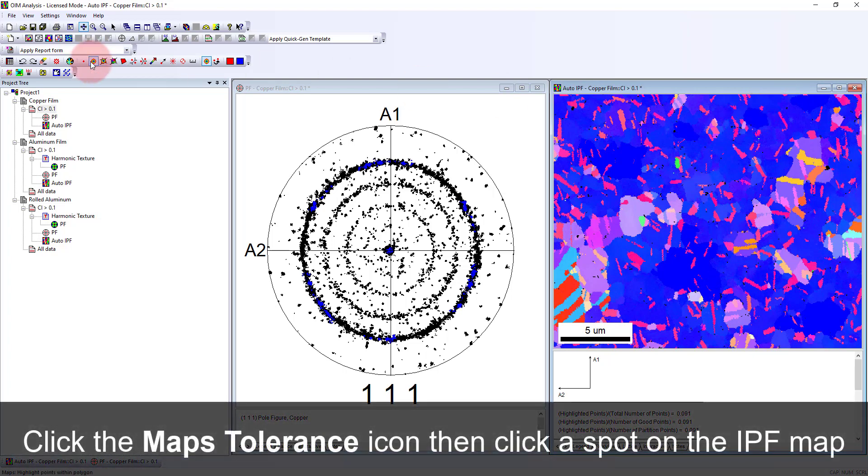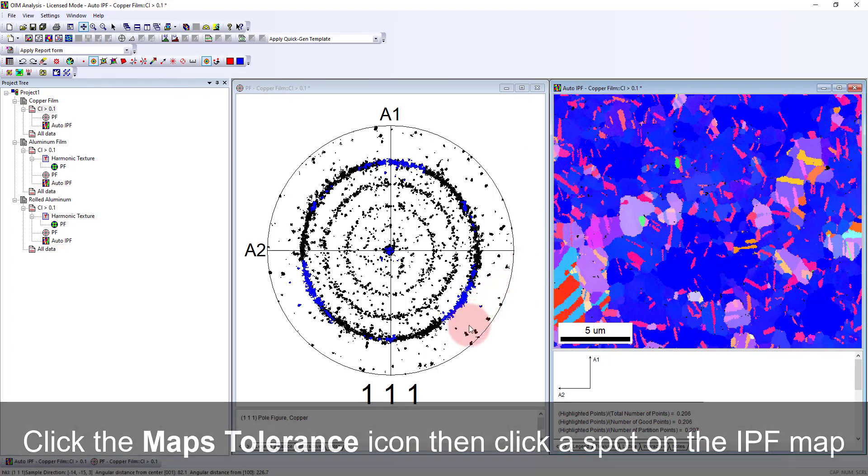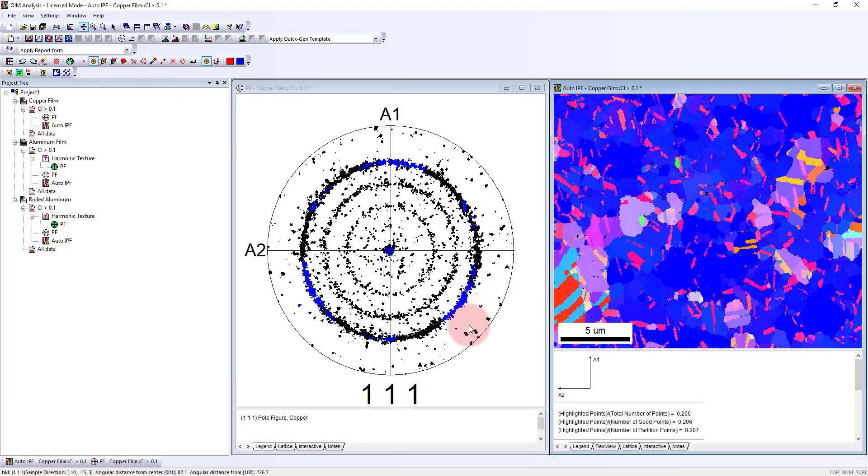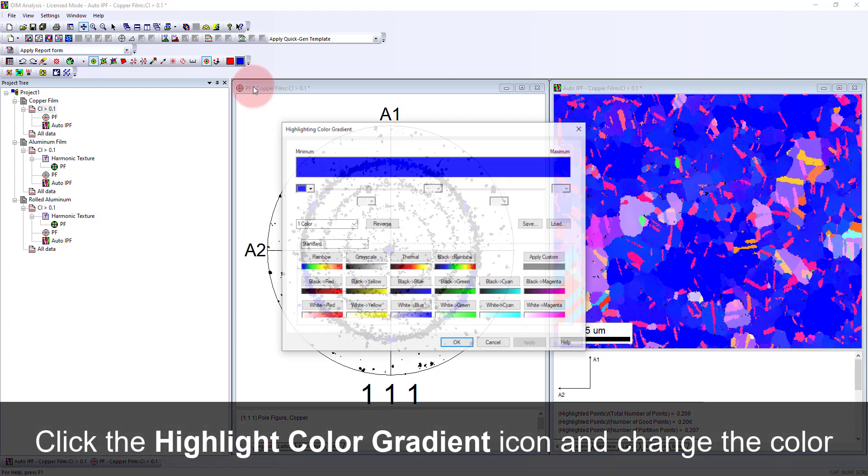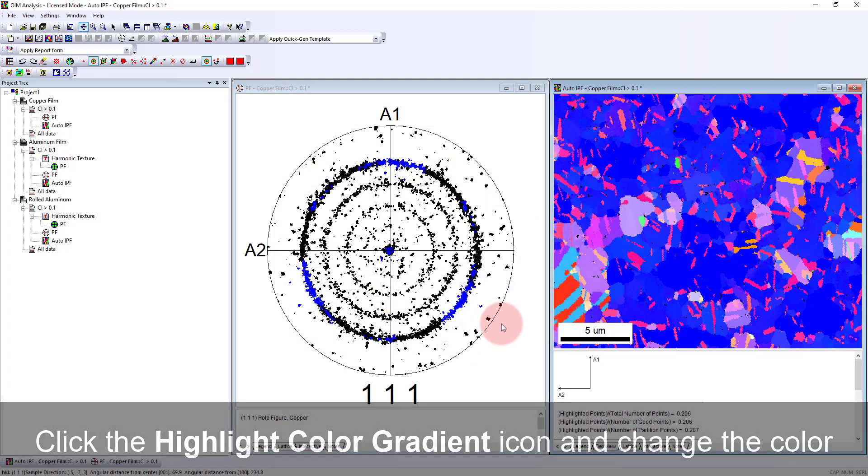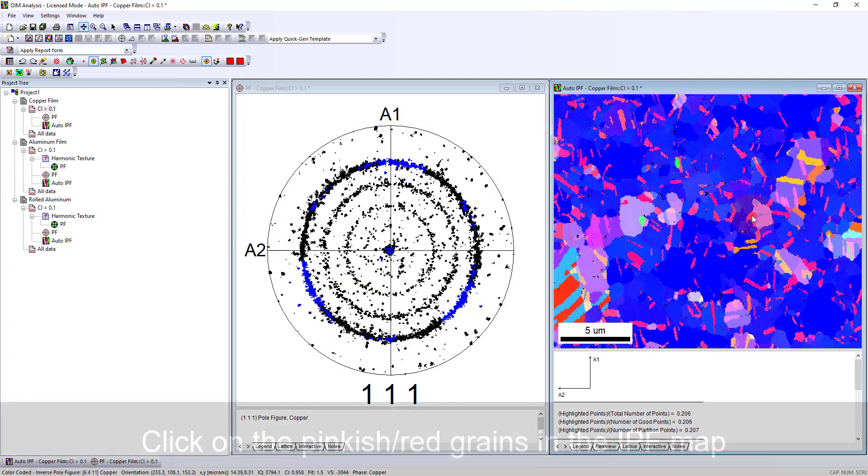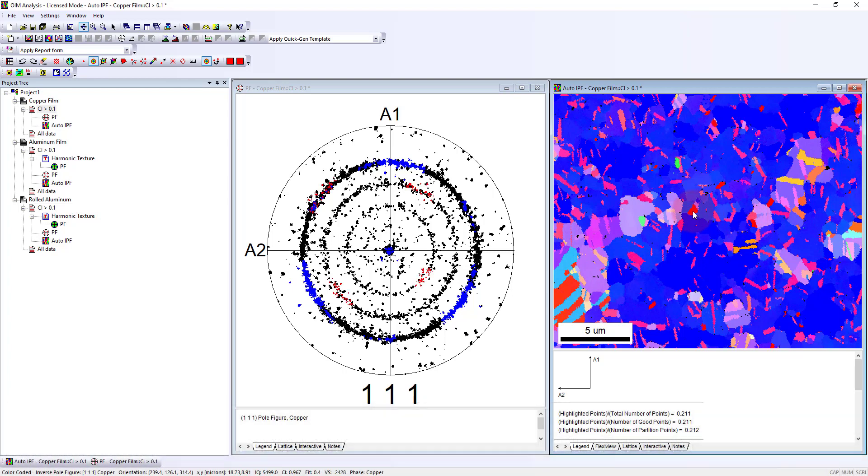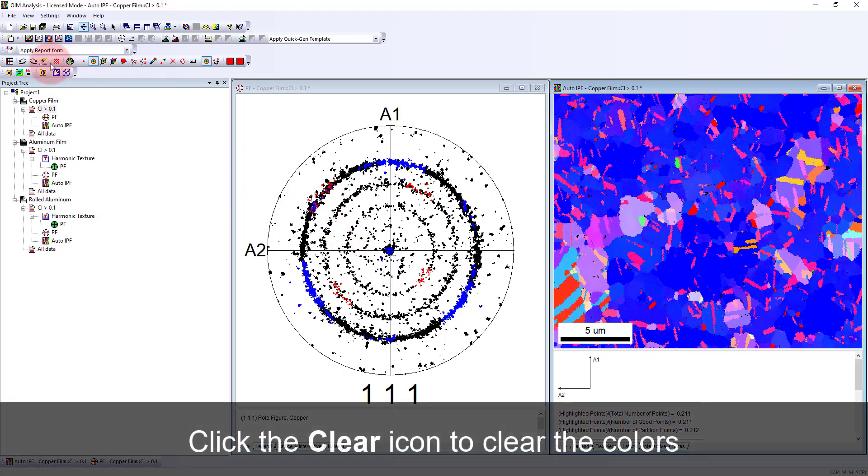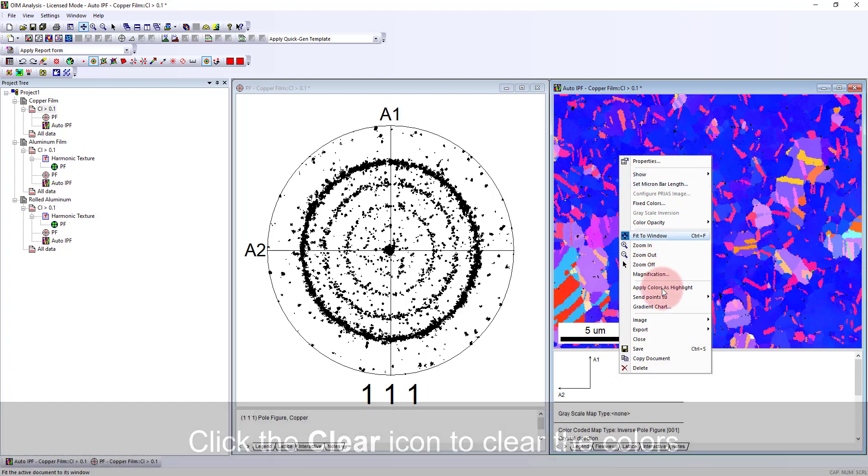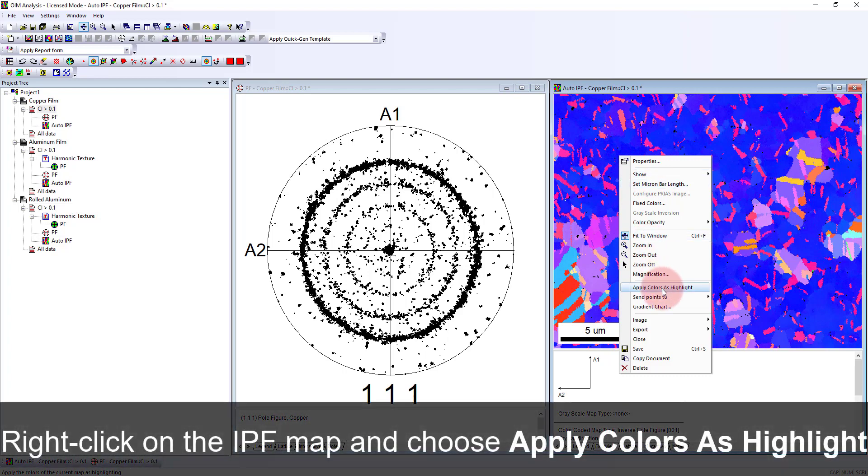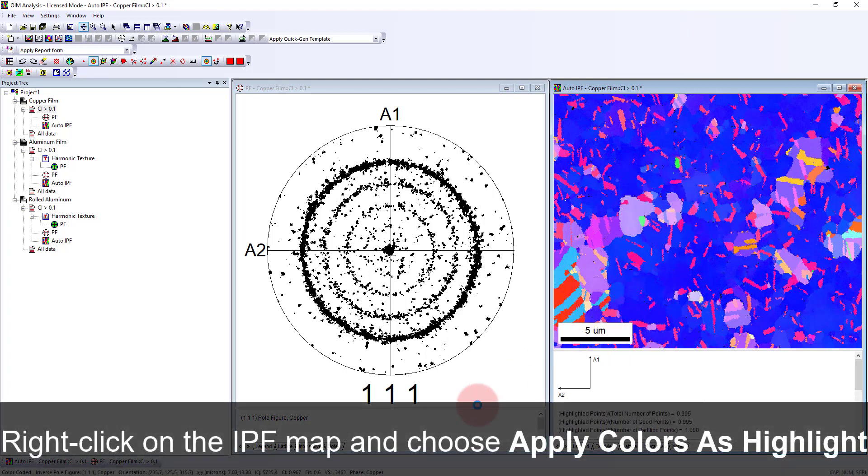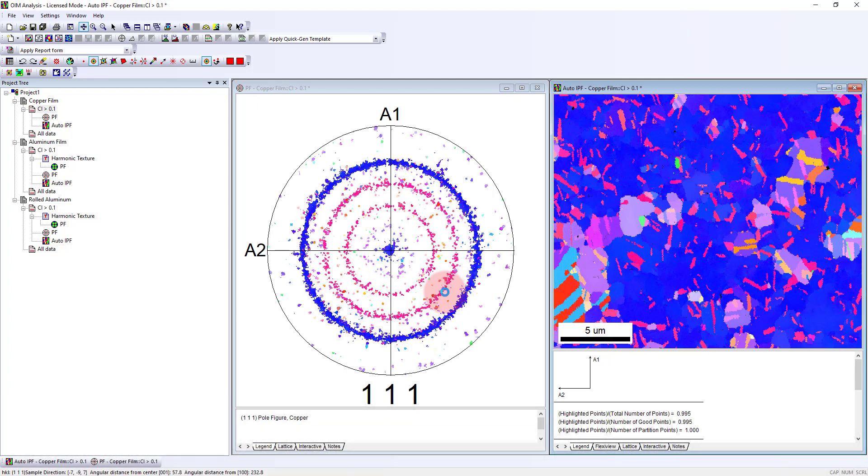Then we can see these other rings. I can pick another color, more of a red color, and pick ones that are pinkish red to see where that lines up. That starts to fill in some of these other rings. Rather than doing this manually, I can clear the colors and apply the colors here as a highlight. We can see the representation of this onto the pole figure.